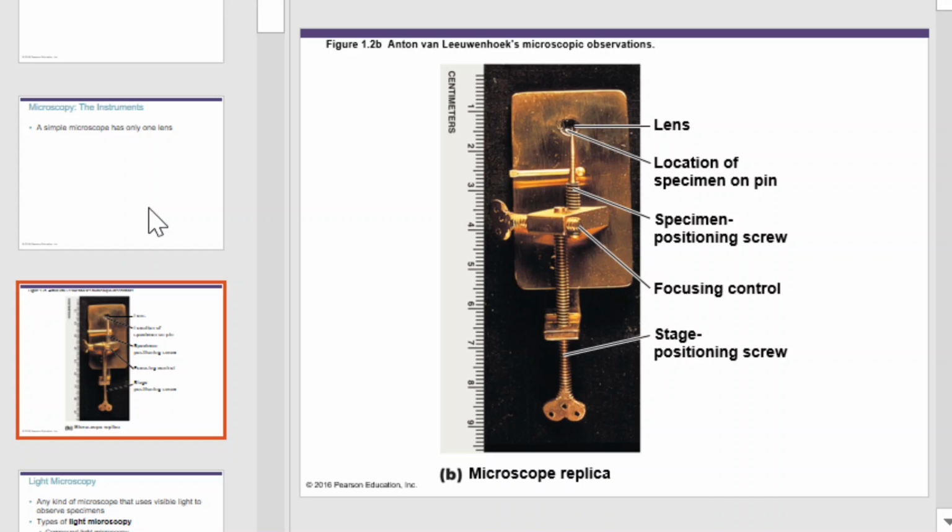This is a picture of the first microscope that was used by men like Robert Hooke and Anton von Leeuwenhoek. In order to use this microscope, a specimen had to be balanced on a pin, and then the viewer would examine that specimen through the tiny lens while holding the entire apparatus up to the sunlight.